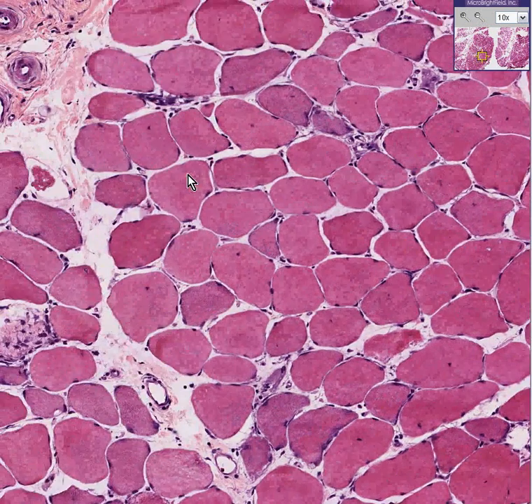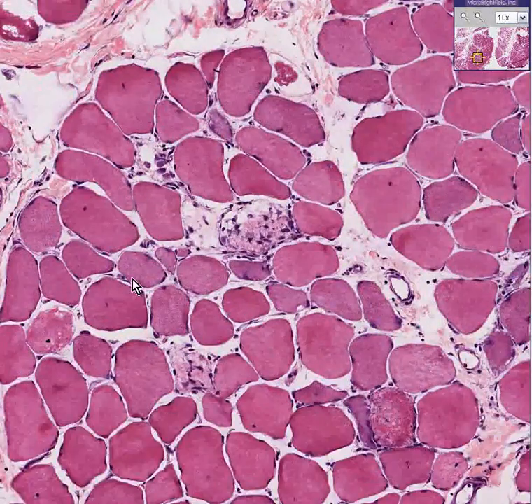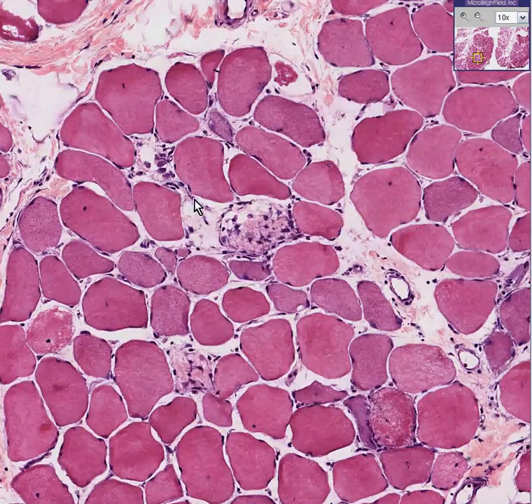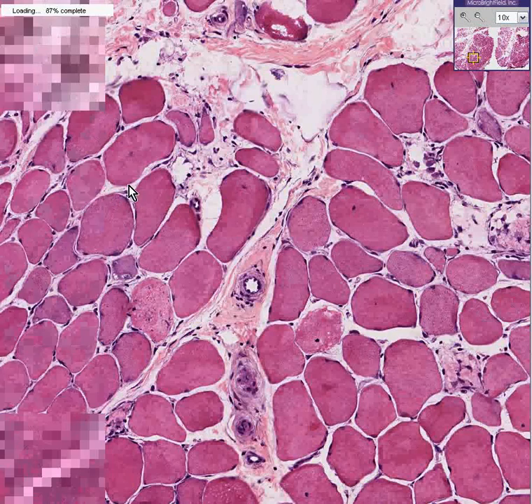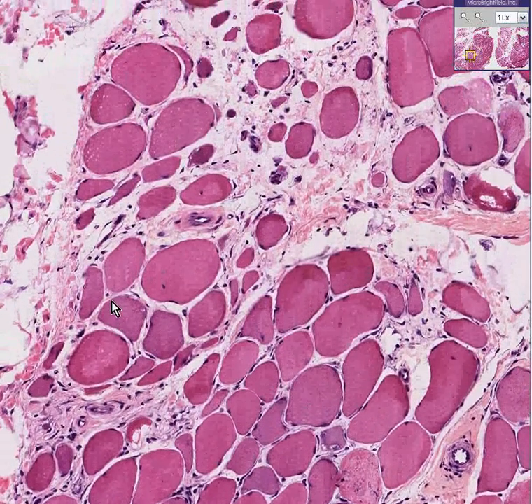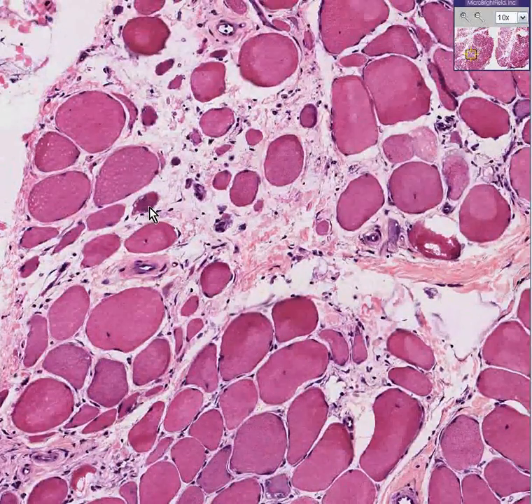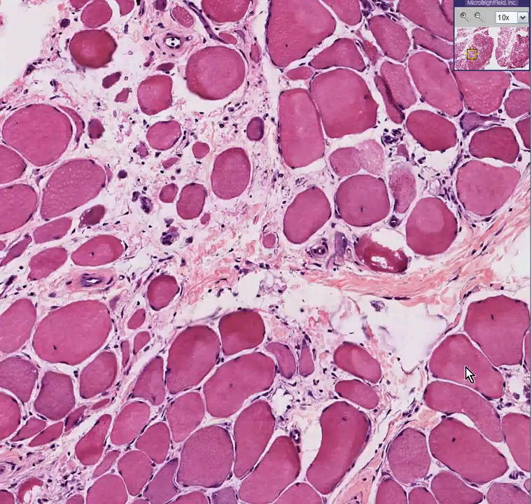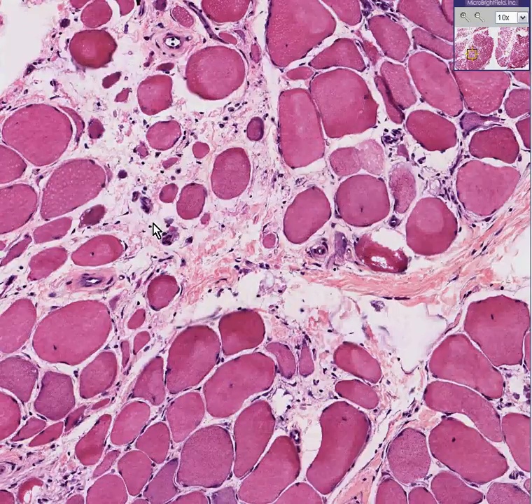Let's look at the areas as it gets a little bit worse. In this area there are a lot of fibers that are very small and purplish. Because of their small size and dropping out, the amount of connective tissue between the fibers is relatively more. And as the disease progresses, you can see that in an area like this, many of the fibers are extremely small and extremely non-uniform or discolored. Perhaps some of the fibers in this group may have to hypertrophy to compensate for the atrophy of many of the other fibers.